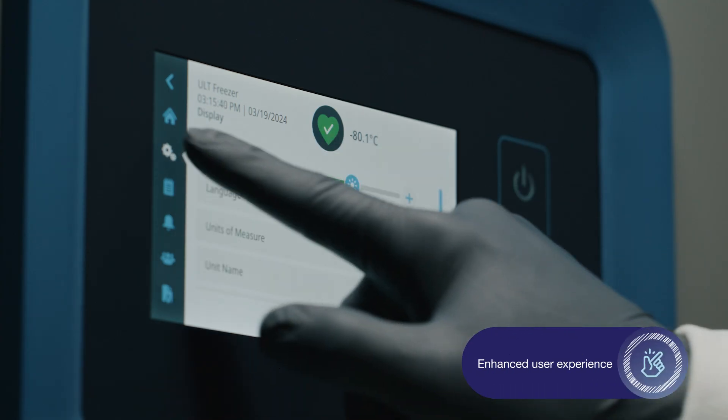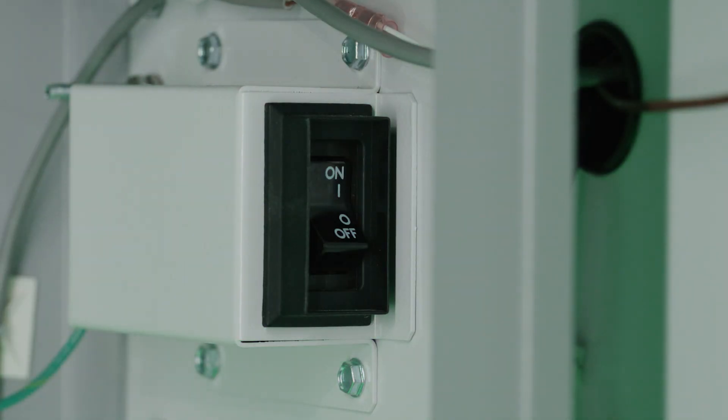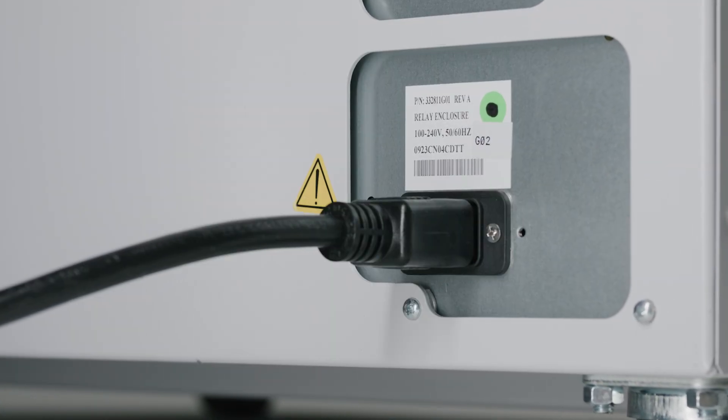Universal isn't just a name, it's a design. TSX Universal ULT freezers can internally regulate voltage, so simply plug in the unit's power cord anywhere nearby.